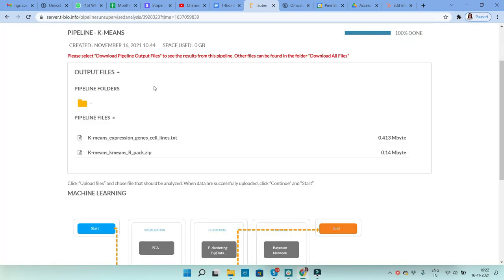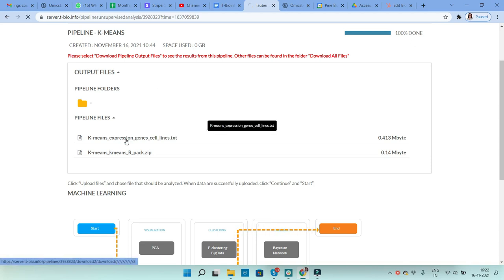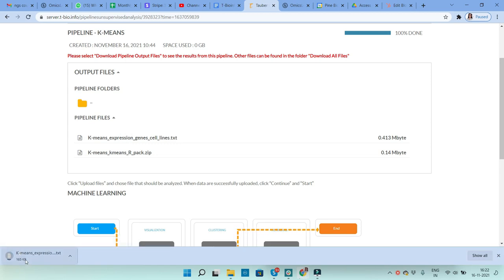K-means does not have a visual output. So let's take a look at the table of samples with a cluster assigned to each sample. Clusters table only will have the result in a tabular format.